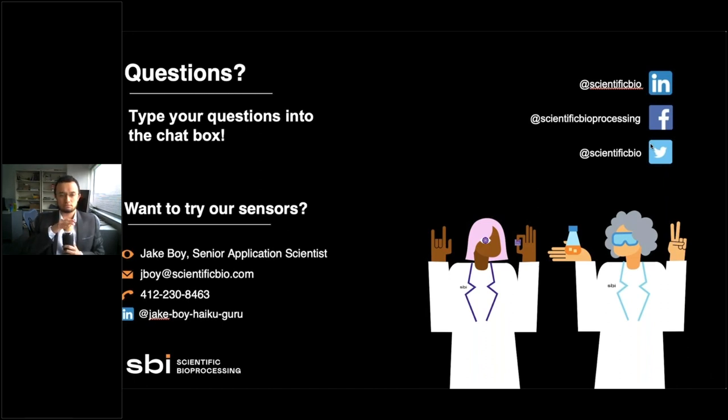You could do this with one reading device, and we have a fiber optic enabled reading device where you can run fiber optic cables from the device. This is a pretty normal thing we do in perfusion applications, like in the feeding lines before and after a culture chamber. And yeah, we could do it the same way. You would have one fiber optic cable on the inlet, one on the outlet, and you can use one reading device to monitor the oxygen on both sides of that device.